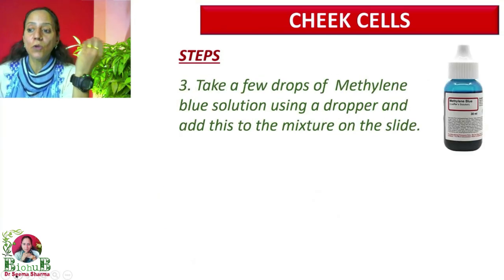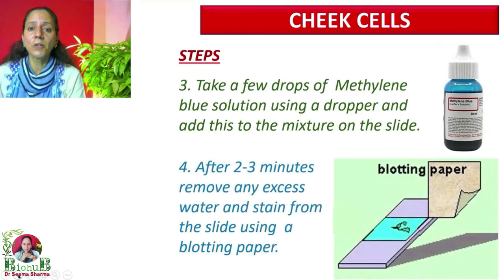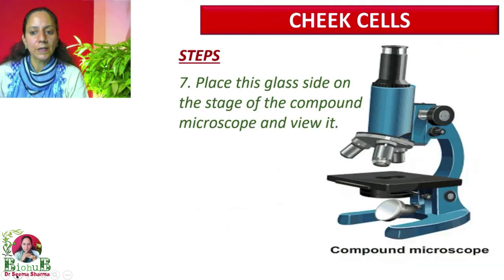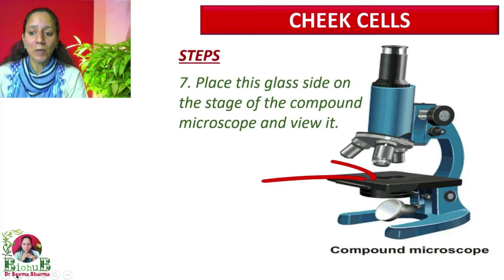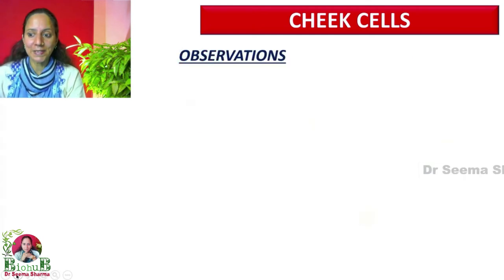Step three — add a few drops of methylene blue solution using a dropper. Place a cover slip very gently, and use blotting paper to remove excess dye or stain. Next step — place this glass slide on the stage of the compound microscope and view it in the same way as in the case of the onion peel cells.